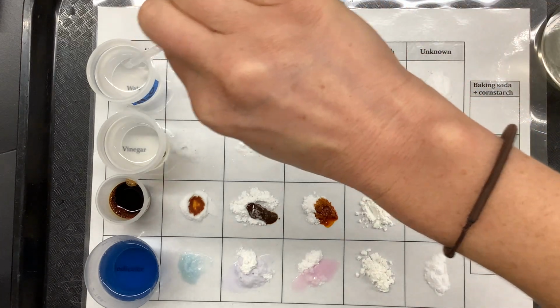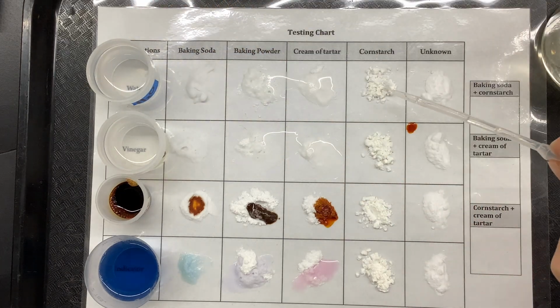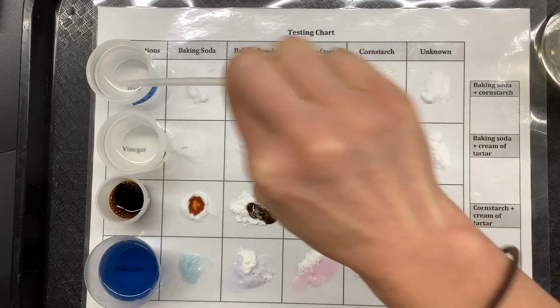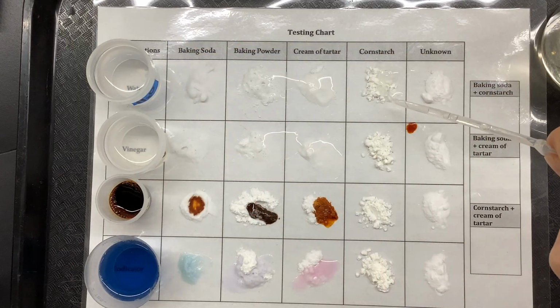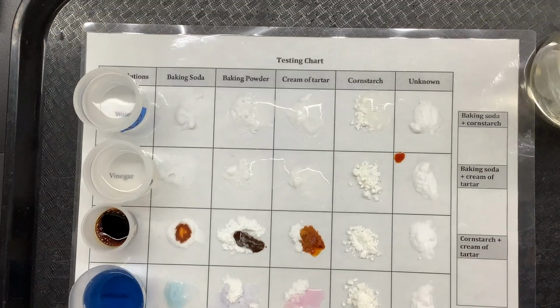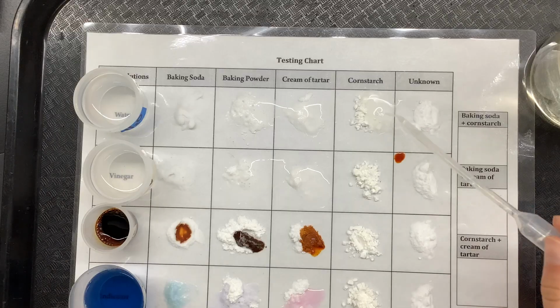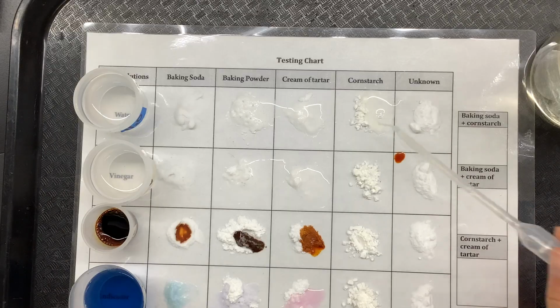Cornstarch and water. Let's do a little more. Are there bubbles forming? Or is it just mixing? Kind of looks like those bubbles were maybe from my dropper.